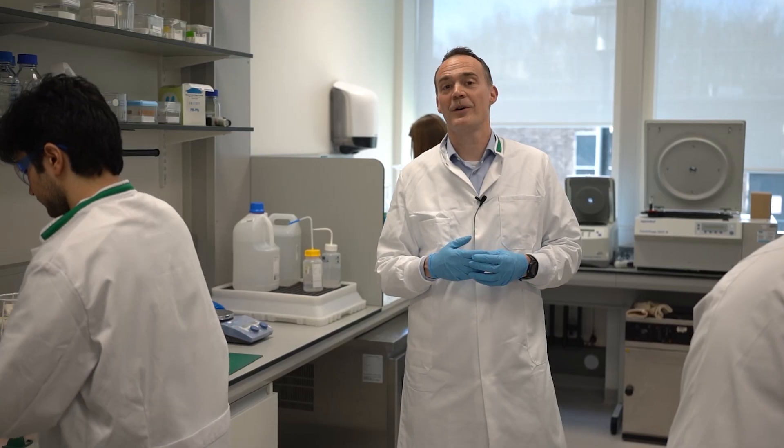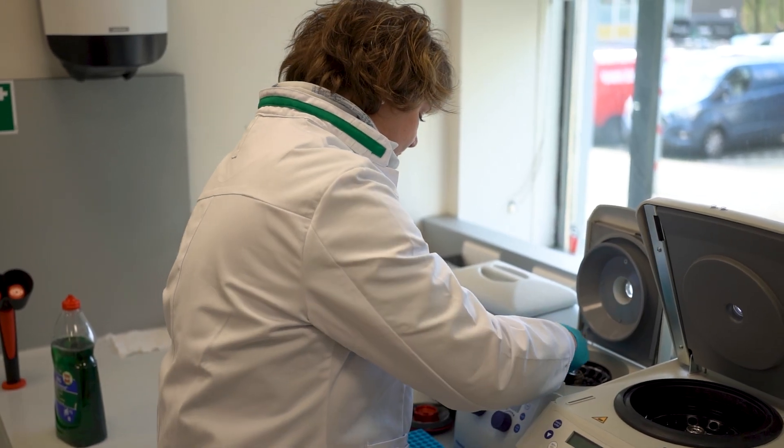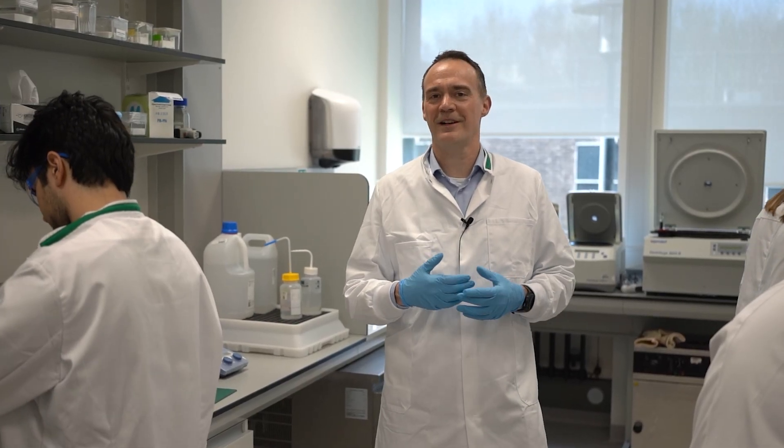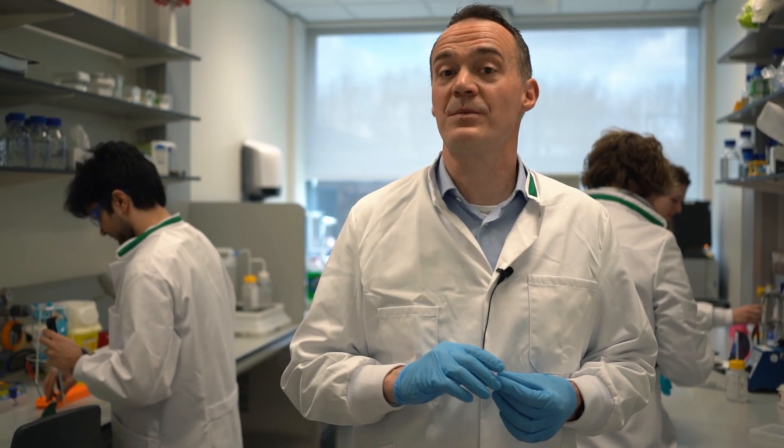You might have noticed that we are very often wearing gloves in the bio lab. Now in a standard chemistry lab, people typically wear gloves to protect themselves from the sample, but here it's actually mostly to protect the samples from us. One of the things we make here in the lab is, for instance, DNA.